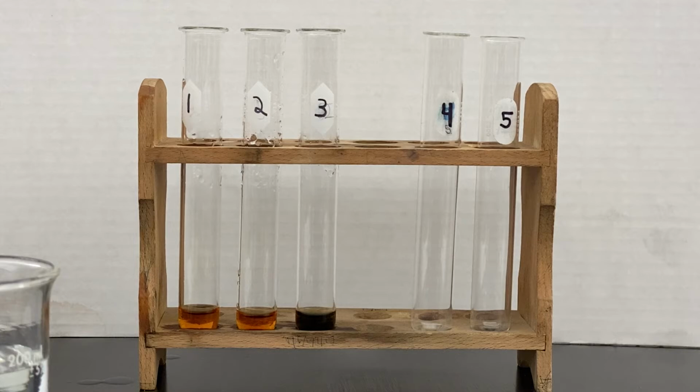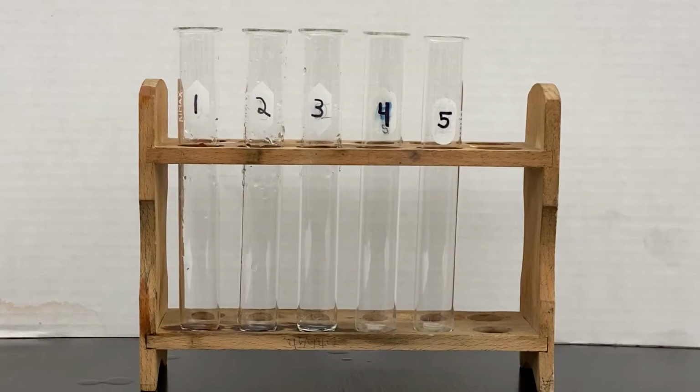And from our previous experiment, it looks like the monosaccharides make the Benedict's solution change color. The disaccharide, test tube number 2, did not change color for the Benedict's or the iodine test. Now that we know how to use our 2 chemical indicators for carbohydrates, we're going to try to apply that knowledge and find out the types of carbohydrates that are in 5 foods that are relatively common in our household.